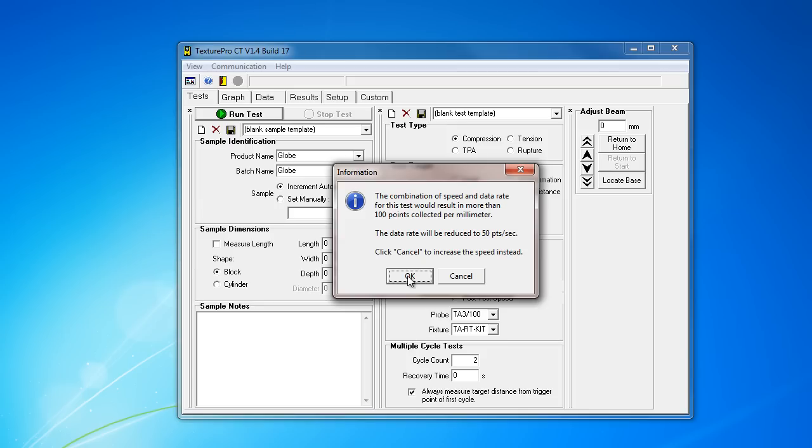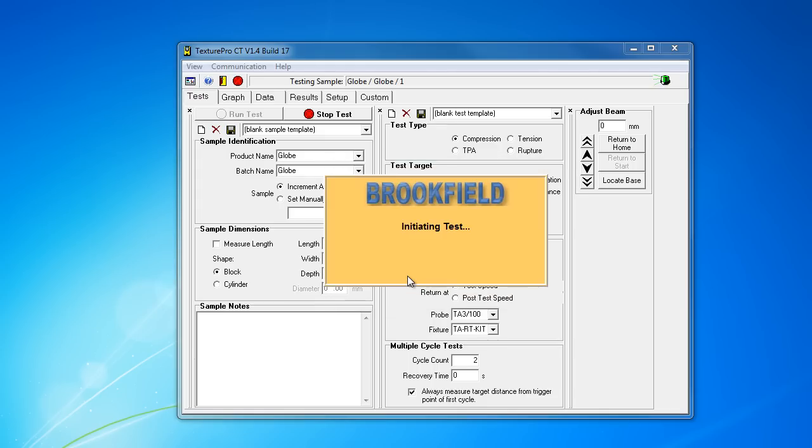Oh, it's got a limit of 100 points collected per millimeter. Compared to Brookfield's competitors, this limit is about a fifth of what other modern texture analyzers can do. I'm just going to go ahead and run this test. It should be fine for this example.